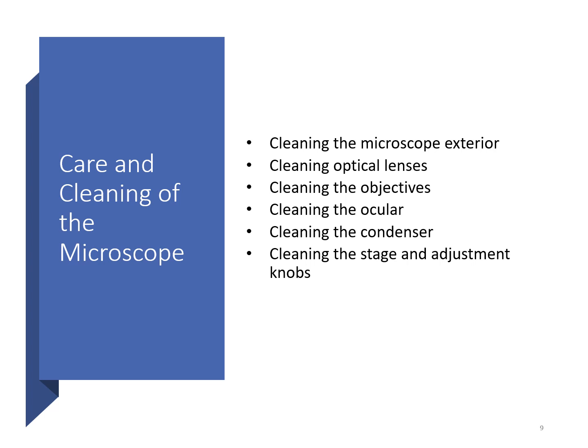So we want to make sure that we clean them properly, remove all that dust, make sure that we don't have anything that's blocking the movement of our stage or anything like that, so any kind of dried up old oil or anything. And so by making sure that we keep the microscope clean, make sure that we don't have any scratches or anything on our lenses, this is going to help us to view our slides so that we don't have anything kind of interfering with our field of view and magnification.